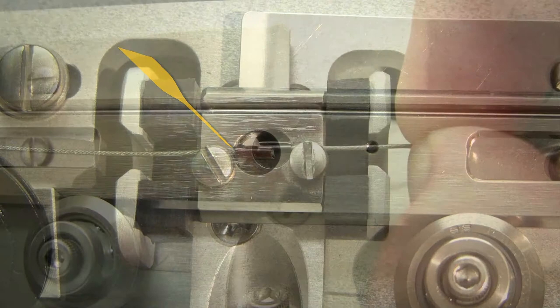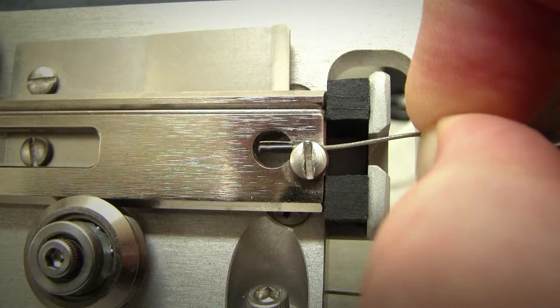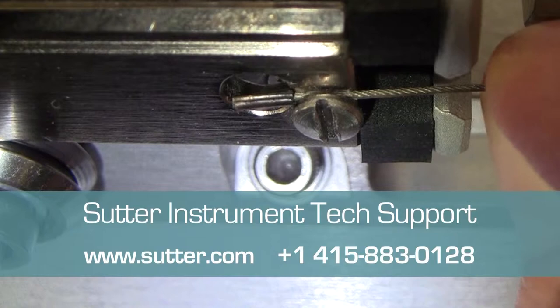If the swage is at an angle in contrast, the retaining screw is loose. Once pull is applied to the cable, the swage rotates outward and sideways force is applied to the puller bar. Contact Sutter tech support if your puller looks like this.